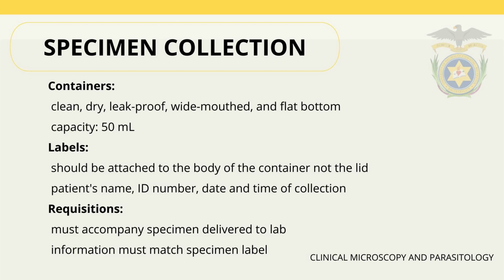Labels should be attached to the body of the container and not the lid. It should also include the patient's name, ID number, date, and time of collection. Under no circumstance should the label be detached even if the container is refrigerated or frozen. For requisitions, they must accompany the specimen delivered to the lab, and information must always match the specimen label.